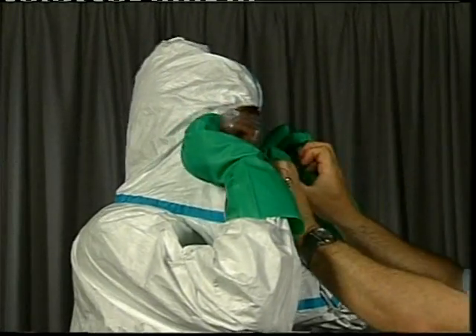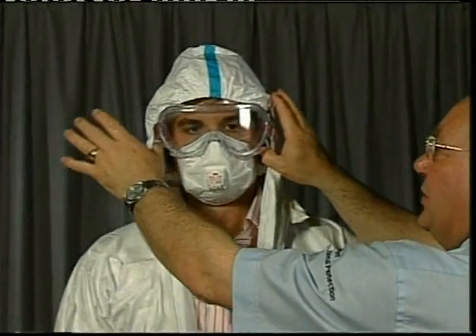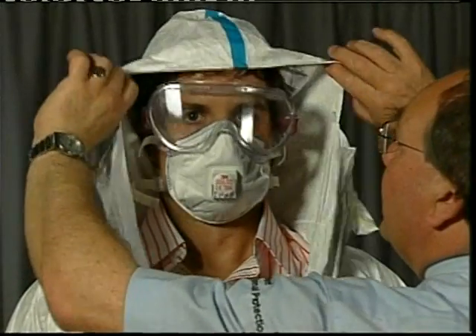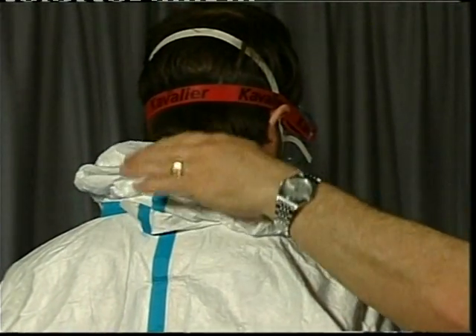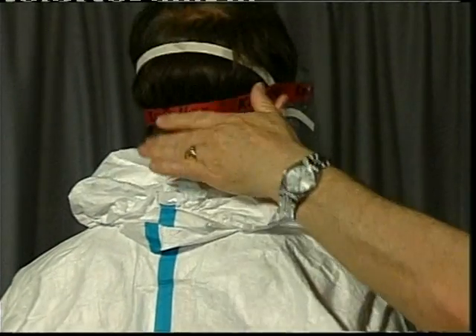For undressing the hood, take the two thumbs, pull the fabric away from the head, and then roll the hood away. When you turn around, the hood has been turned inside out and any contaminated area on the outside has been turned away from the head. You now have a clean piece of material against the back of the neck.